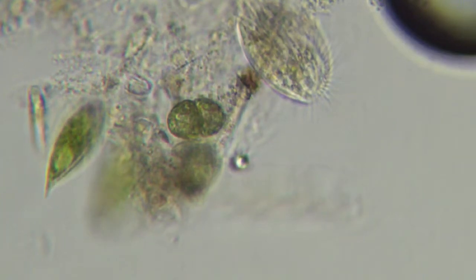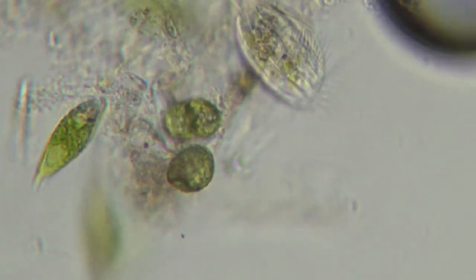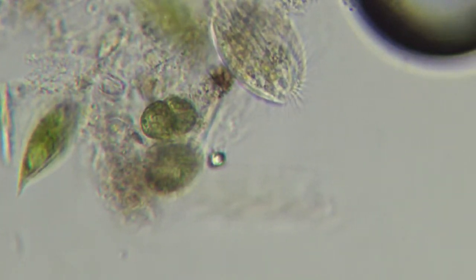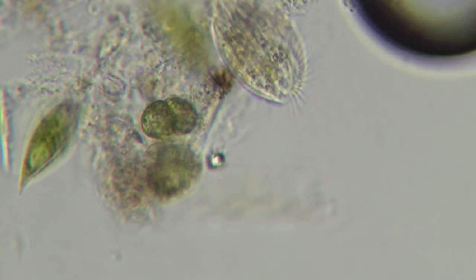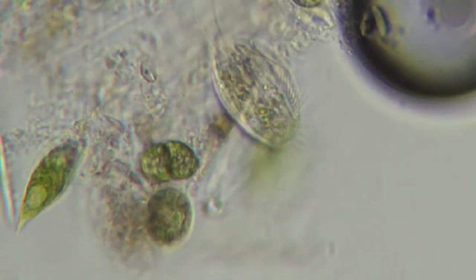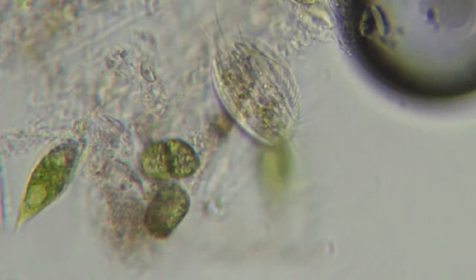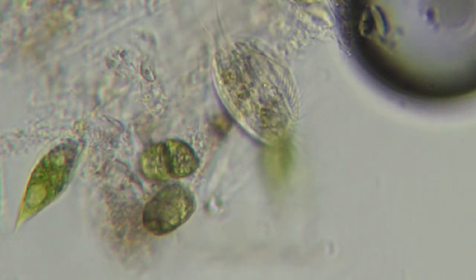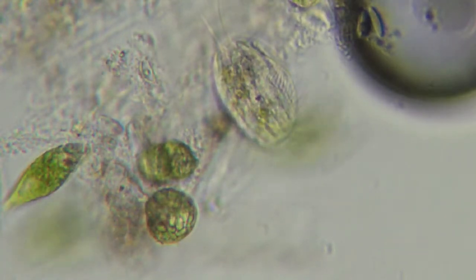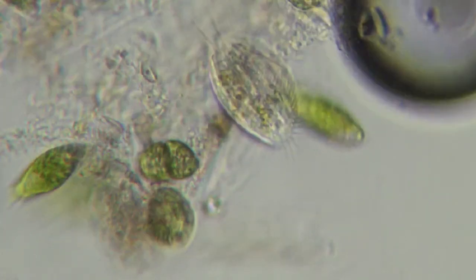Hiding in the debris. See the cirri? Top and bottom. Long, spiky bits. And eventually it will try to crawl with those like little legs, if it feels like it. It's one of my little favorites because it acts so much like bigger animals, although it's a single cell. Really nice.